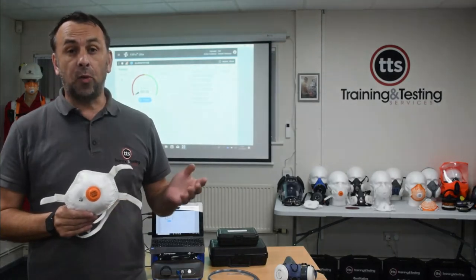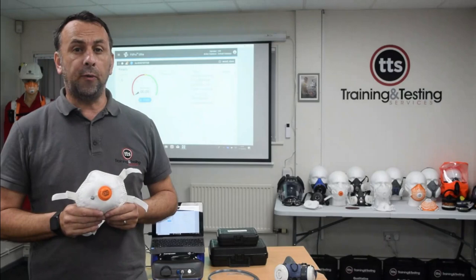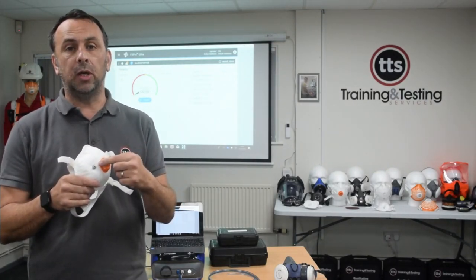So the first mask that we're going to be testing this morning is the disposable Alpha Solway 3030V. This is a great disposable mask. In my opinion, it's one of the best fitting masks on the marketplace. Now, in order for us to test this on the PortaCount machine, we have to adapt the mask, i.e. we have to insert a sampling probe.